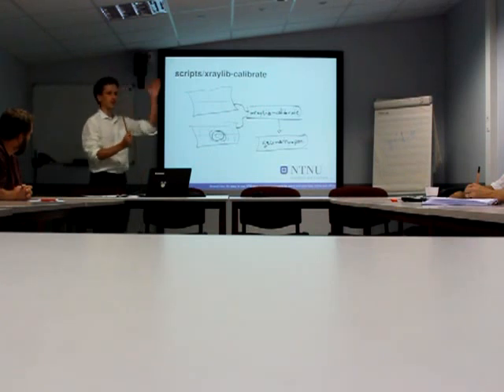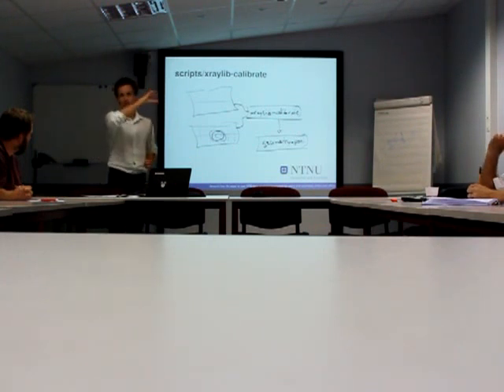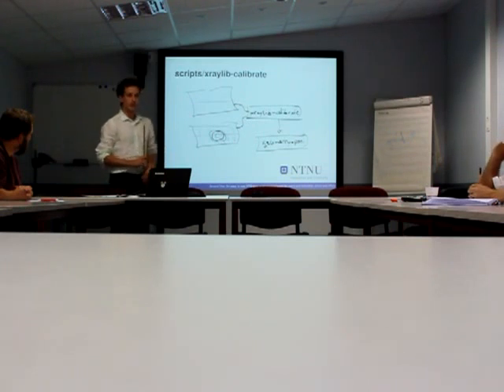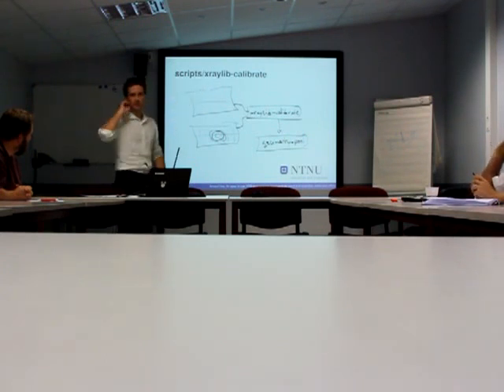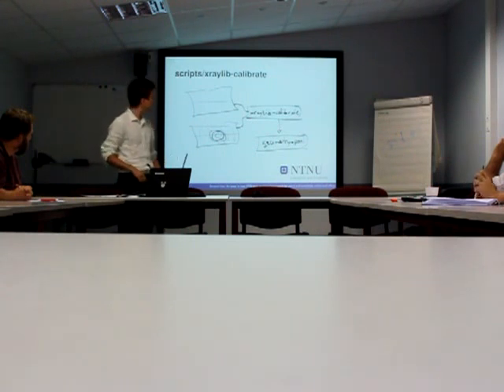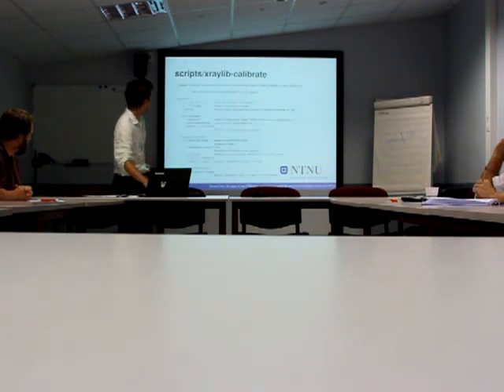So it divides into sectors and integrates, and when the image is properly calibrated, it should be equal intensity. So there's some least square regression on this. First in the origin of the beam and then the tilts. I found it might get stuck in some local minimum if you try to do both simultaneously for the start. And the tilts are very small, so you can do this afterwards.